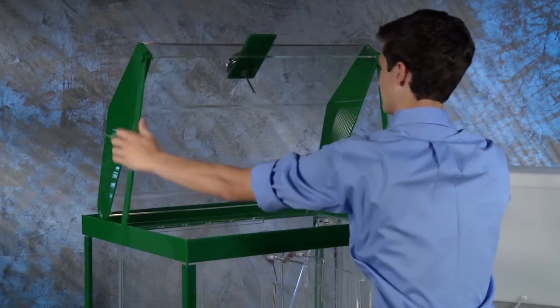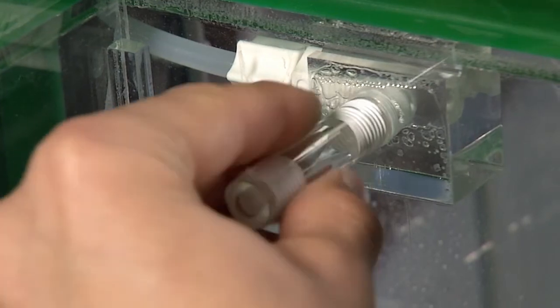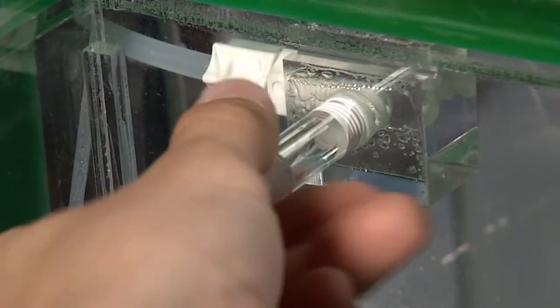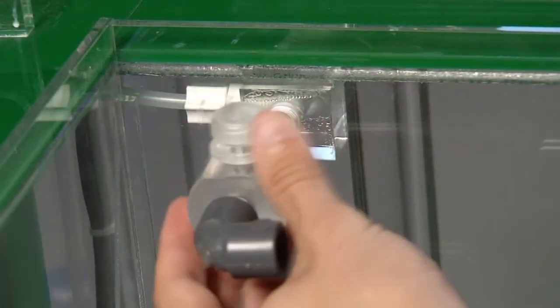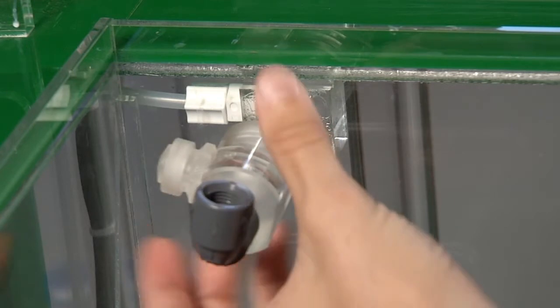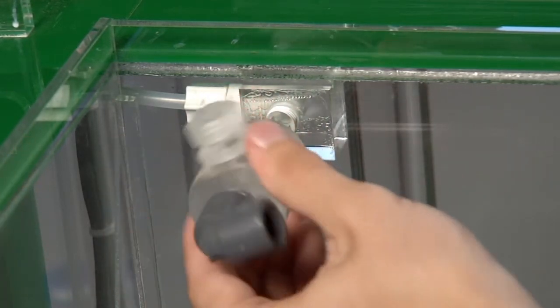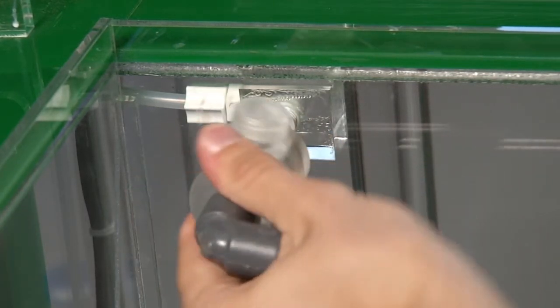Step 2: Take care to keep all foreign materials from entering the pipe and screw the short acrylic quarter inch pipe nipple into the tapped hole on the inside of the chamber. Hand tightening is all that is required. Step 3: Screw the salt spray nozzle to the acrylic nipple installed in step 2 and tighten by hand. Turn the nozzle so the spray direction is toward the front of the chamber and the other tapped hole in the nozzle points down.